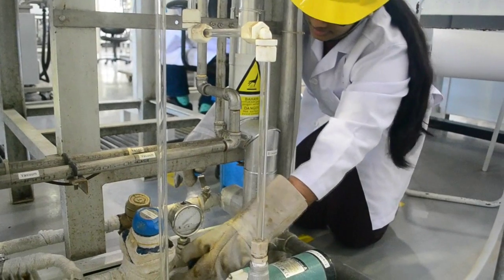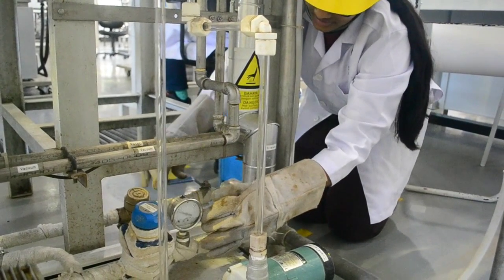Very carefully open the main steam valve and at the same time close the steam purge valve. Start the stopwatch timing. Observe the first bubble appearance and record the time taken.